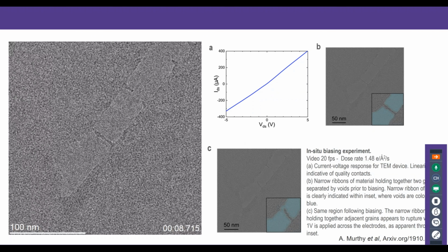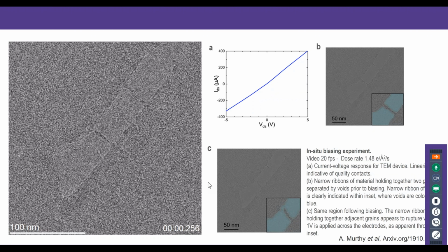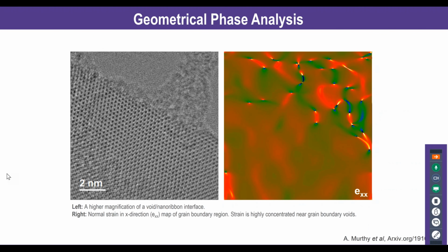And so being able to image this at high resolution also enables us to start looking at different features of the material, right? So this is just a quick example of things that you potentially can do, depending on your sample, of course. This is a measurement of a localized strain field at the edges of this molybdenum disulfide. You can imagine that by collecting that for a minute or 2 with the high quality image, you can see the evolution of the strain in certain regions of your sample, right?